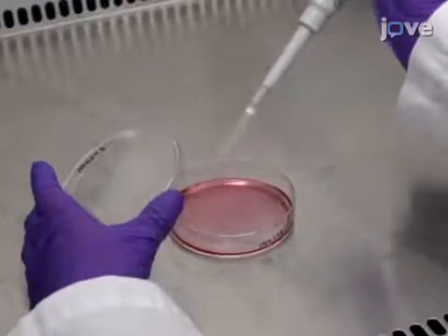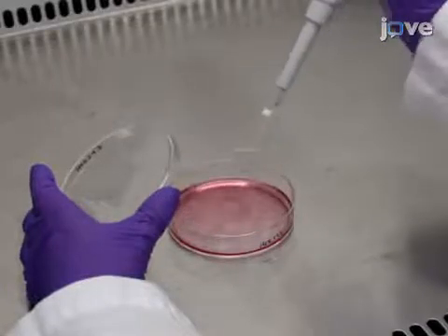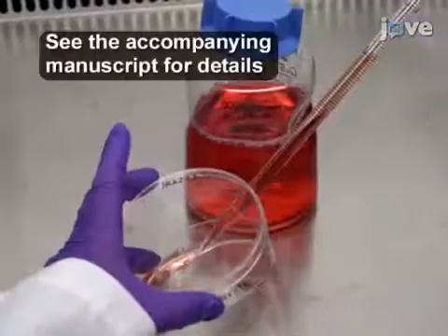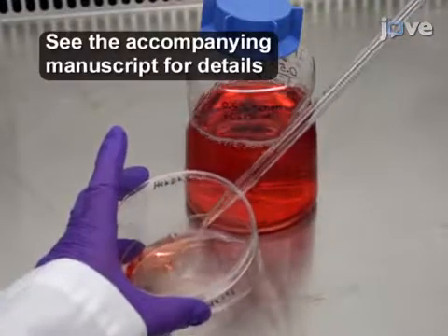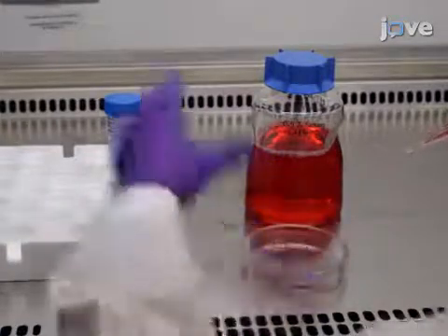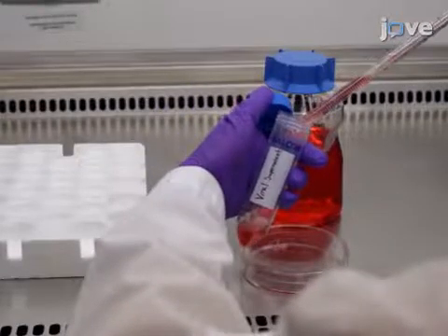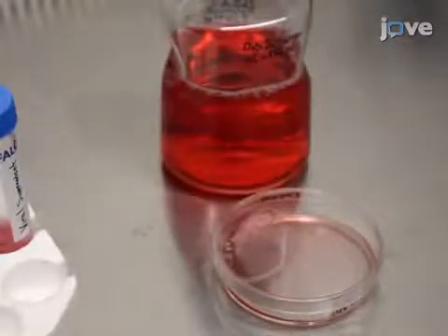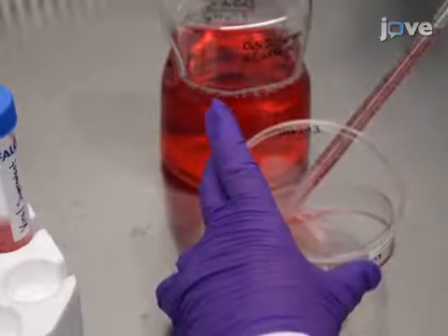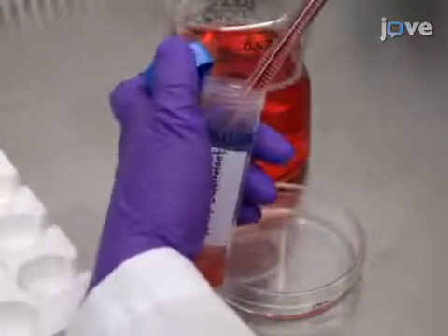After 30 minutes, add 1 milliliter of the transfection reagent in slow droplets to each 10-centimeter cell plate and incubate the cells overnight at 37 degrees Celsius. Replace the media on day 6. On day 7, transfer the media containing viral particles with a 10-milliliter serological pipette to a 50-milliliter conical tube before storing it at 4 degrees Celsius. Then add 8 milliliters of the 0.5% FBS media to each cell plate. On day 8, collect the cell media containing viral particles and combine it with the previous day's harvest in the 50-milliliter conical tube.